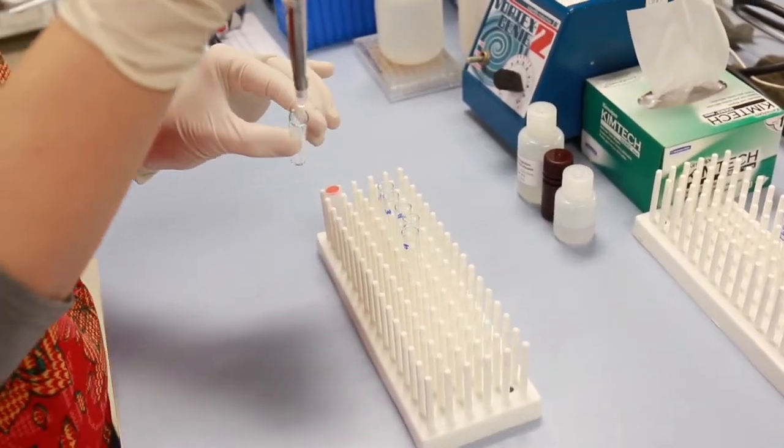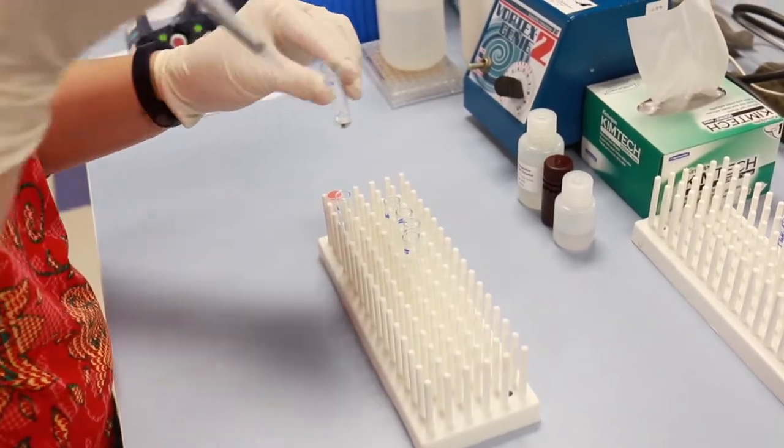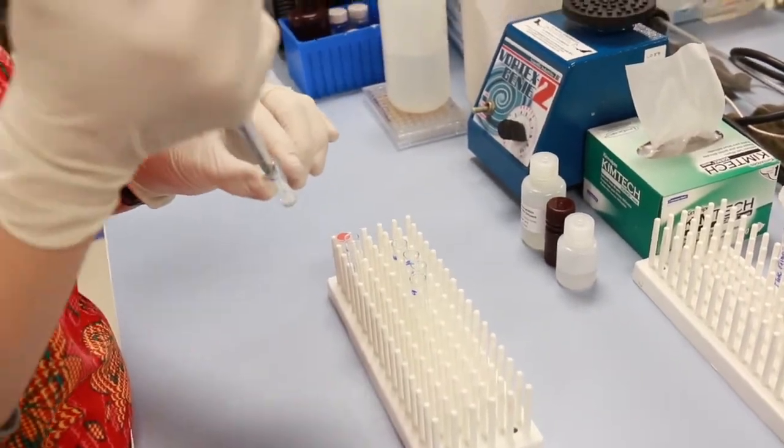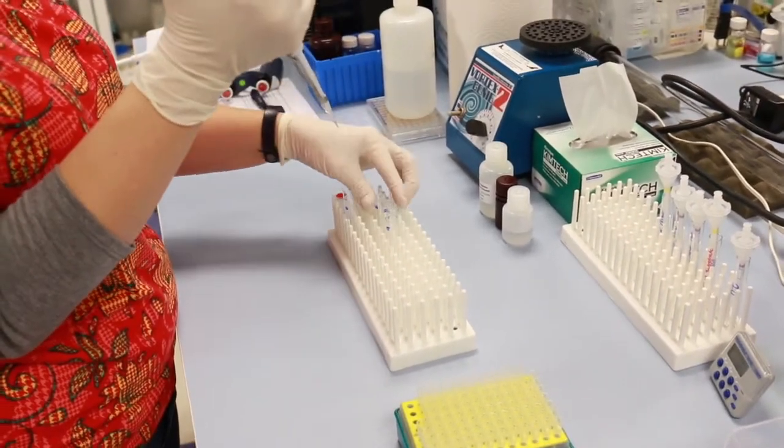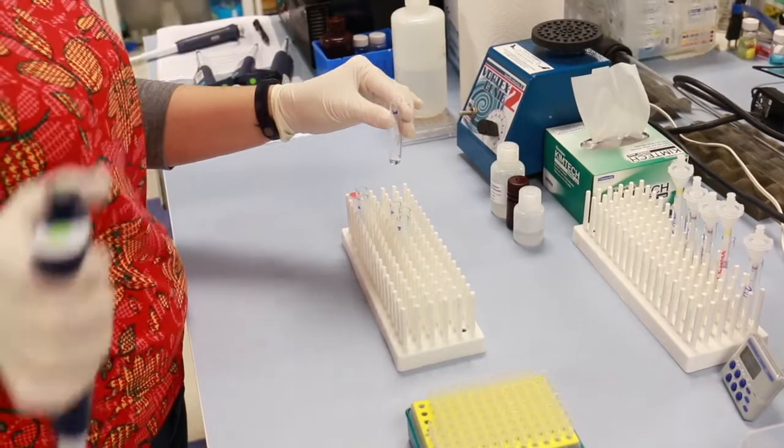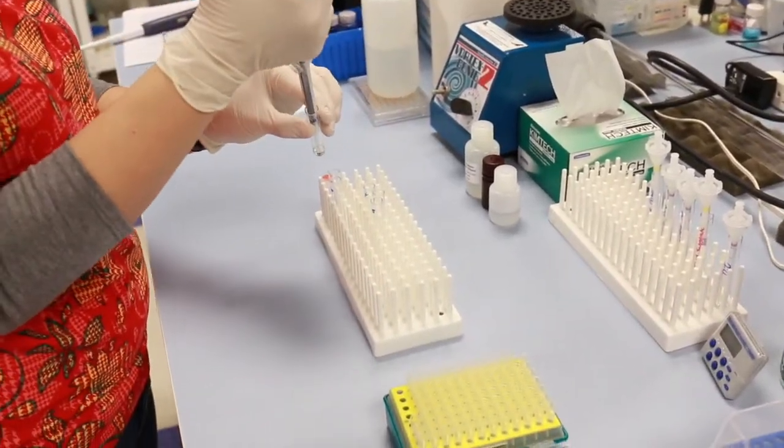When setting up an assay, take the time to position sample and standard tubes in your test tube rack in a logical way to make them easy to locate when pipetting into your plate wells and reduce the possibility of errors.